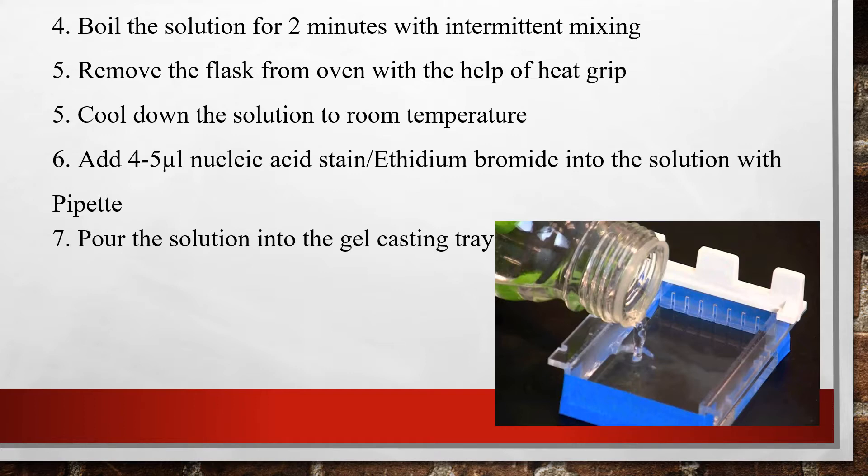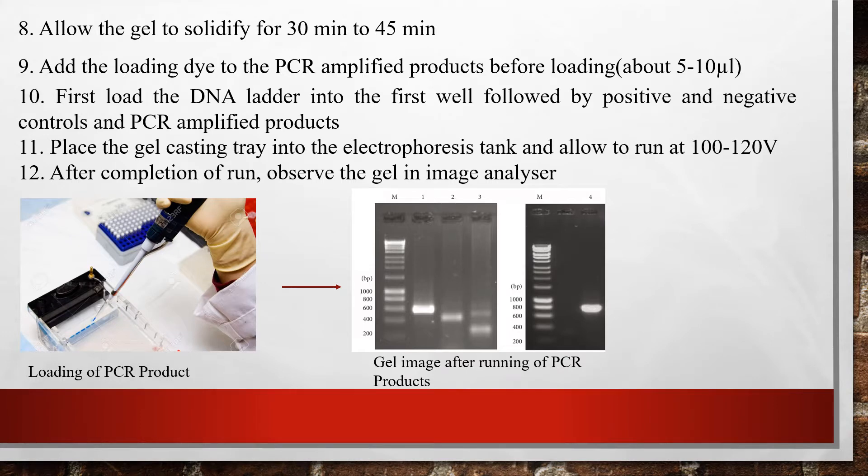After cooling, add 4 to 5 microliters of nucleic acid stain into the solution using a pipette, then pour the solution into the gel casting tray as shown. Allow the gel to solidify for 30 to 45 minutes.